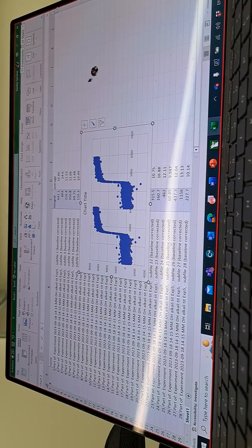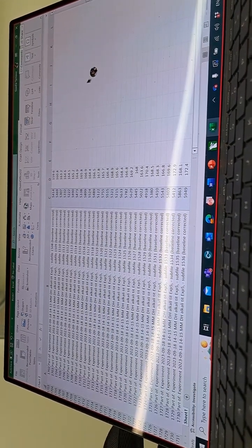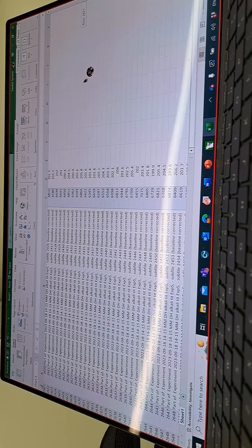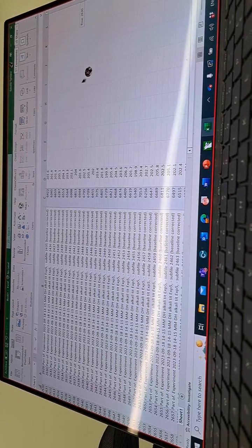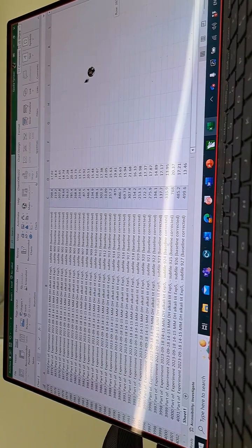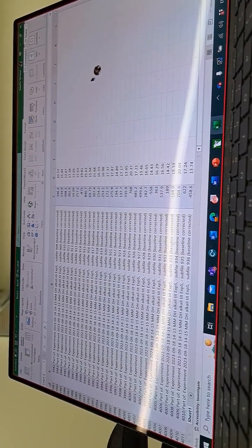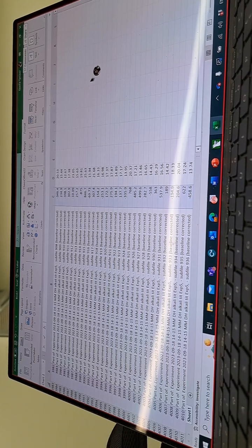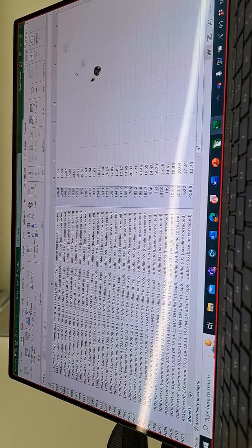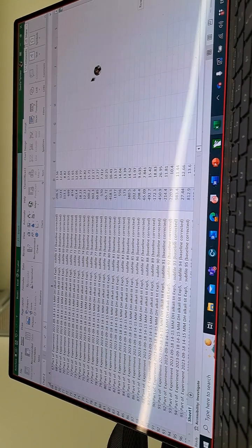This looks like it's the same thing twice. I think you need to check this data. It's the same thing twice. Okay, for some reason. Fine, I will check it.